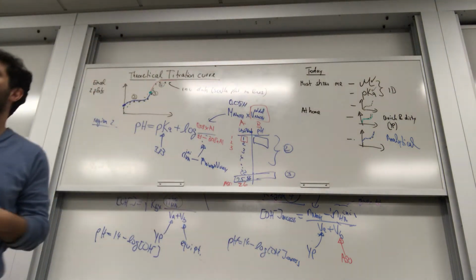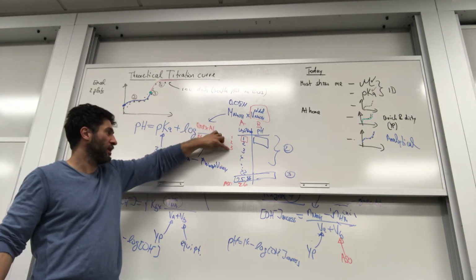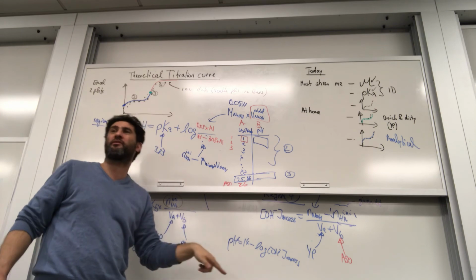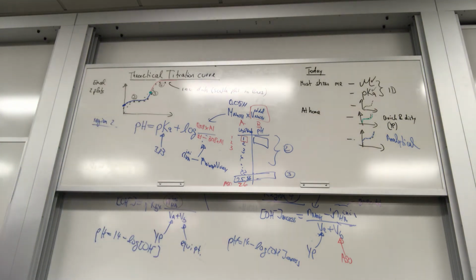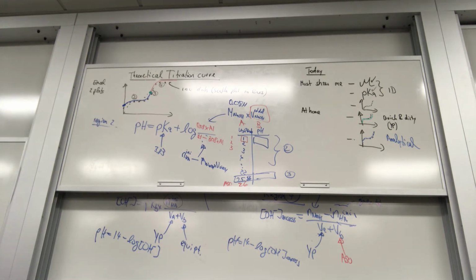Question? What do you mean by A50? I'm just saying, if this is A1, A2, A3, and so on, maybe this is A50, A51, A52, A53, and so on. It's just a label in Excel. All right. Any questions about the quick and dirty?